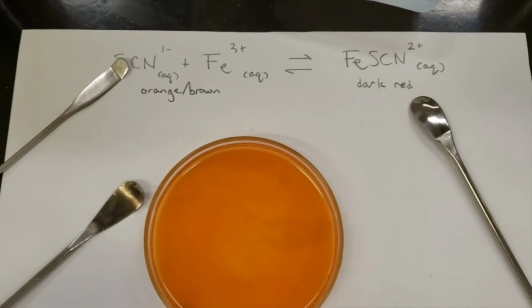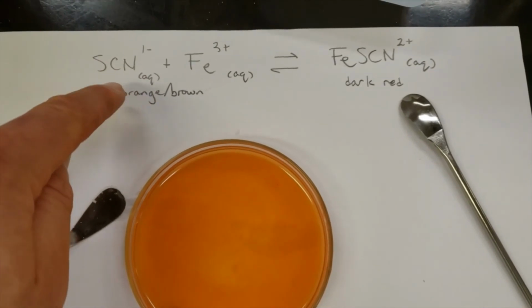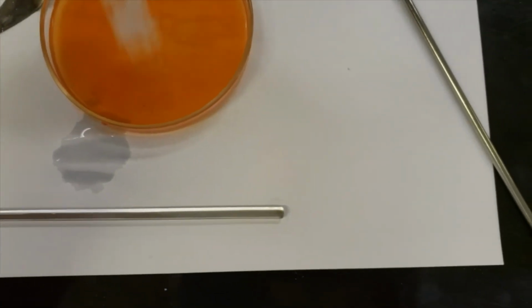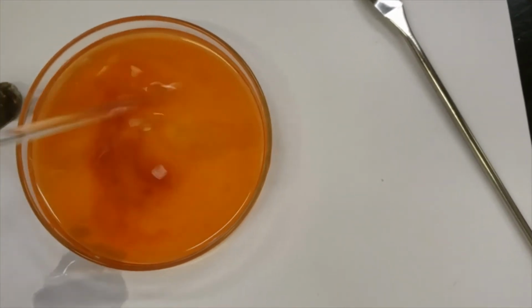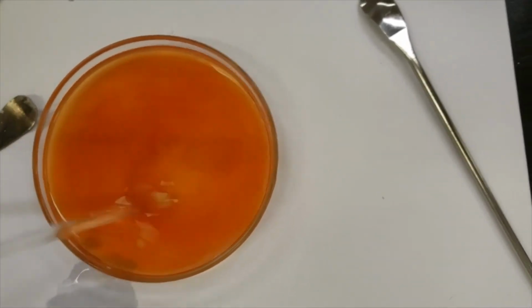Let's now shift it right again, and I'm going to do that by adding more thiocyanate ions. So here's the thiocyanate, so it's a white substance. And if you see right where all those crystals came in, it's a little bit darker. And if I mix it up together here, we'll see the solution gradually get darker.